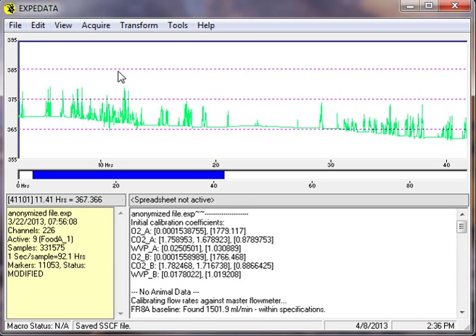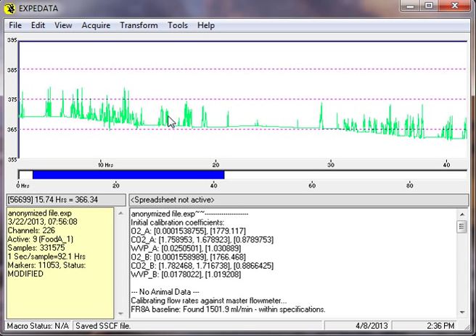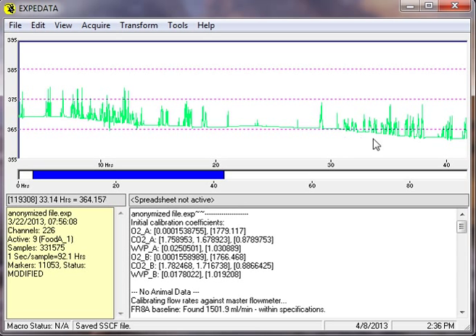And this is the food uptake channel of mouse number 1. This, of course, is the raw data recorded every second. Now, this is fairly confusing. What we would like is simply an indicator of when the mouse is actually feeding. You can see when it's feeding, but that's superimposed on some variations in the mass of the food hopper, caused by variations in the moisture content of the air as well as by the feeding.